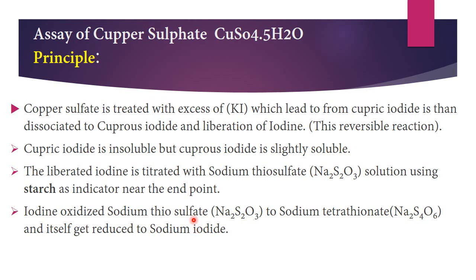So هنا راح يصير عندي أيضا reducing and oxidizing agent. Iodine is oxidizing agent to sodium thiosulfate, and the sodium thiosulfate is reducing agent to iodine to get a sodium iodide.